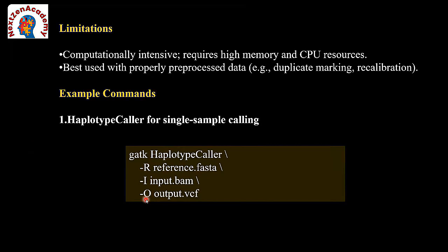It is helpful for a single sample, or for a set of samples. For parallelization, instead of one input, you can give the location of each set of data, and that will end in getting results for each set of samples.